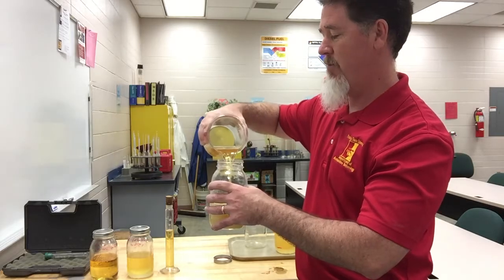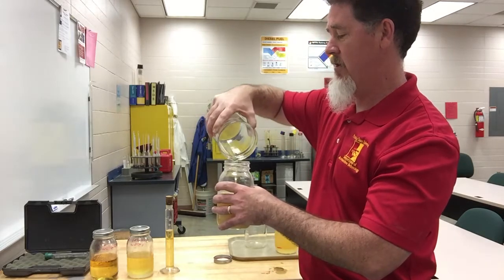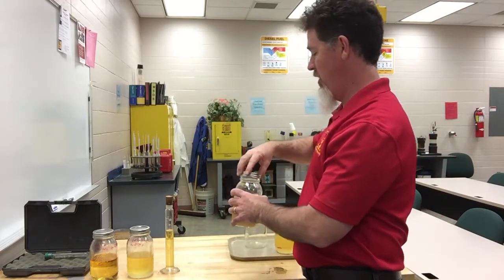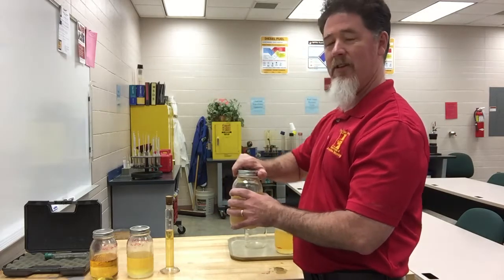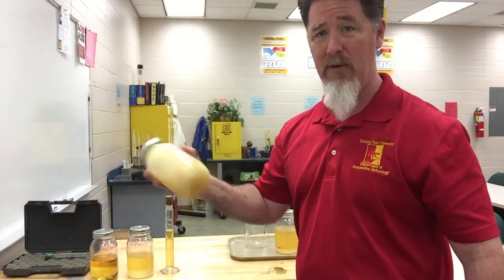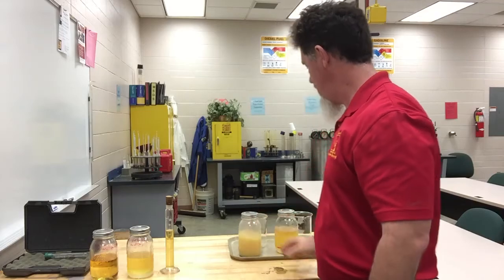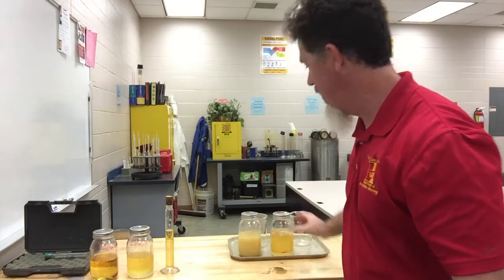So I'm gonna put this one in. And so these 2 samples, 1 sample was old fuel out of someone's tank that's been sitting around for a long time. And so we're gonna shake it up, and then we're gonna let that sit just for a little bit.